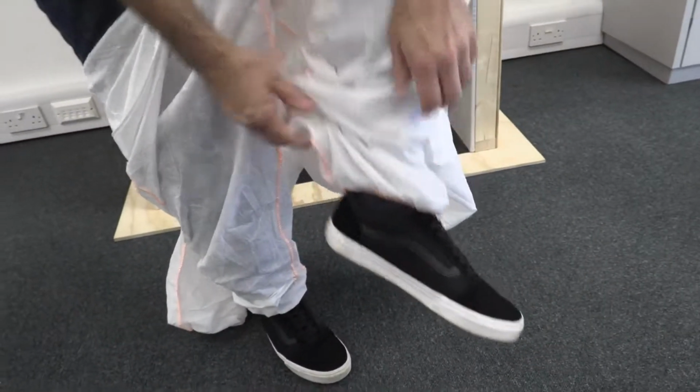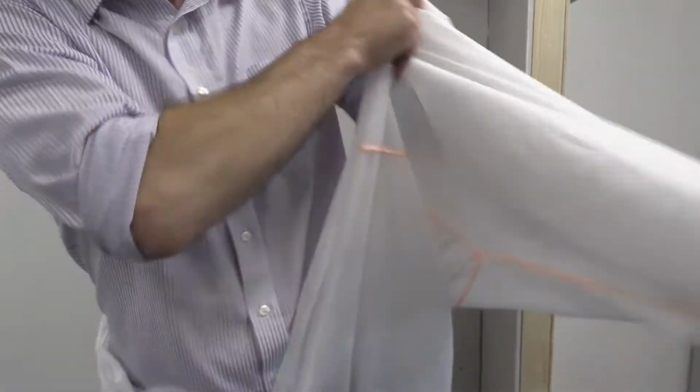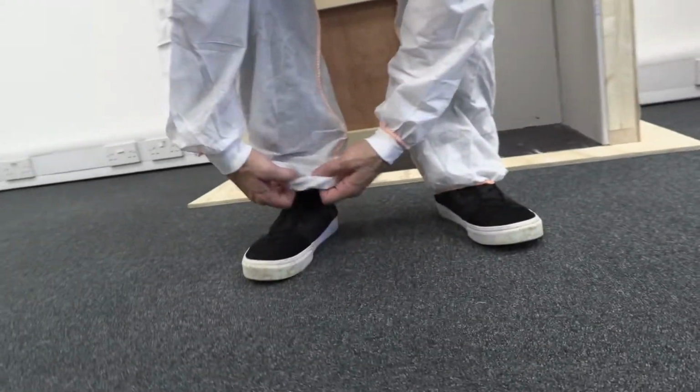It is important to put on your personal protective equipment and your respiratory protective equipment correctly and in the right order. Unpack and put on the disposable overall, ensuring that all your clothing is covered.